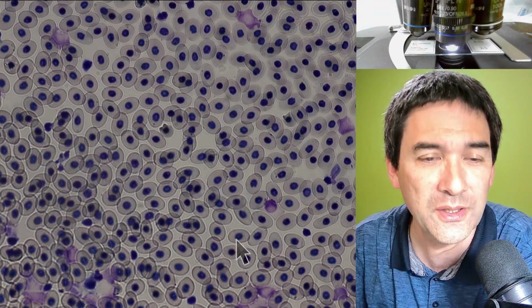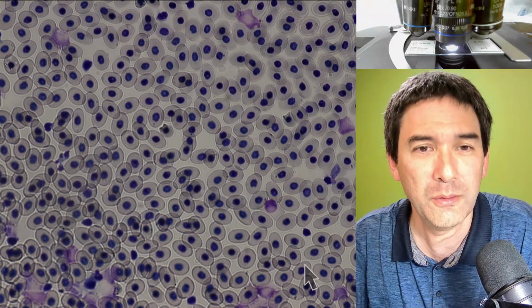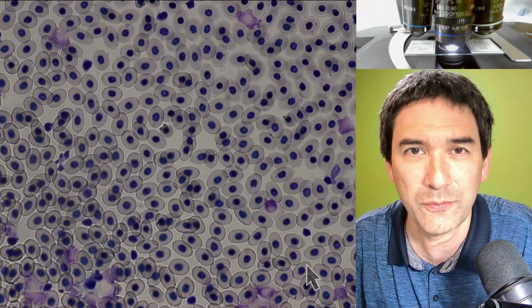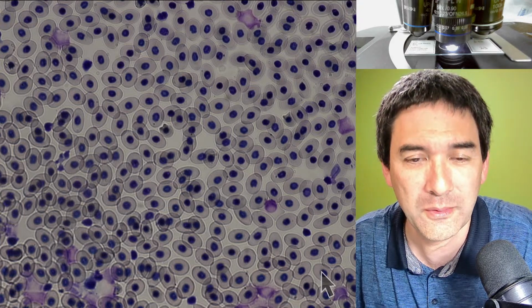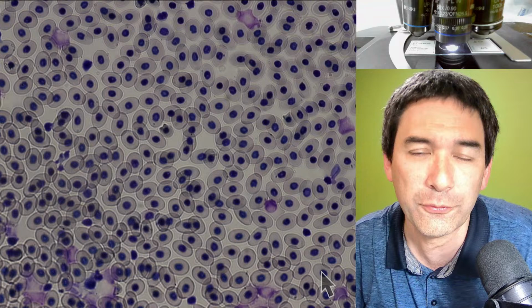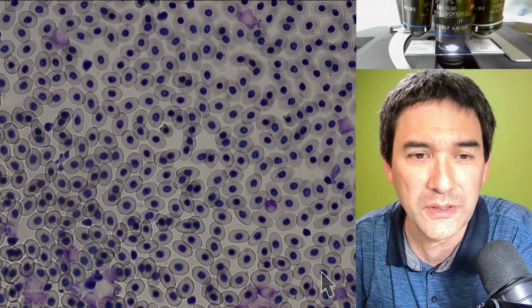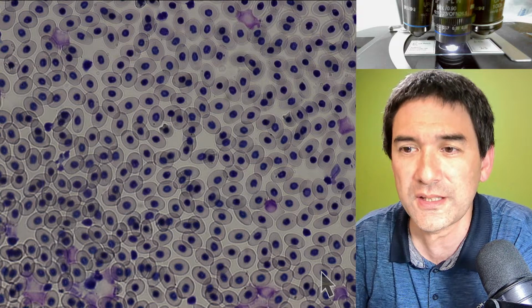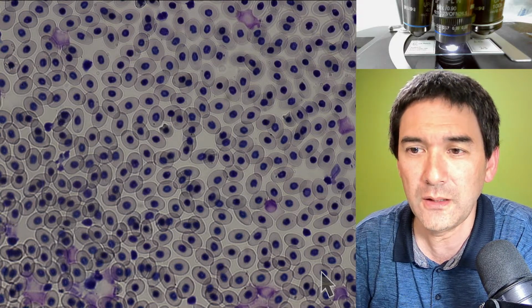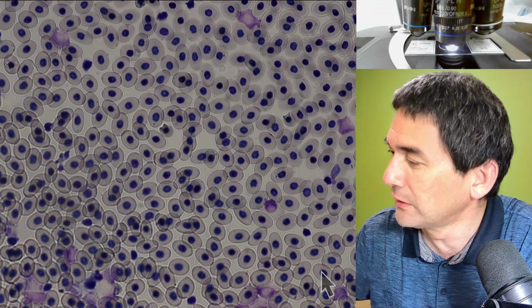So this kind of shows the different strategies of carrying oxygen. Evidently in an amphibian, in a frog, maybe they don't need as much hemoglobin, so they were able to retain the nucleus here. So this is kind of the idea here, simply to show you a little bit of blood.